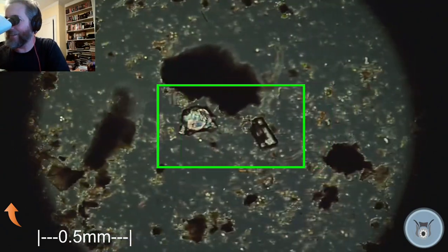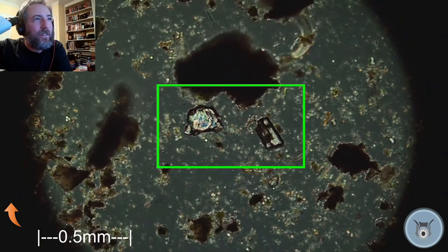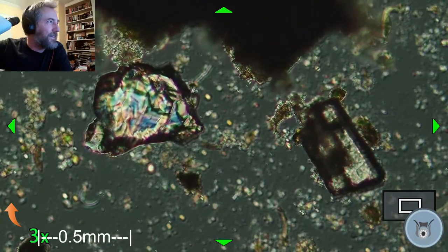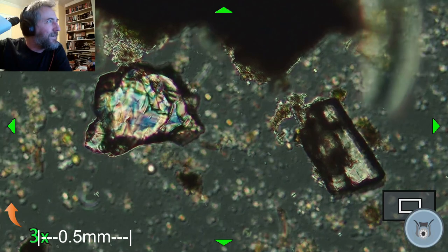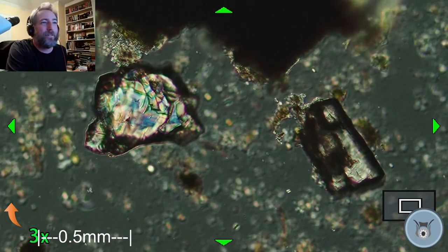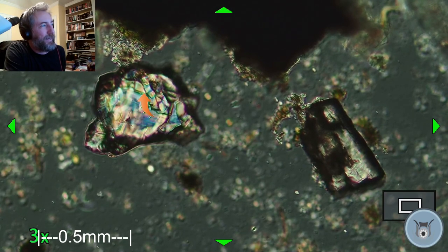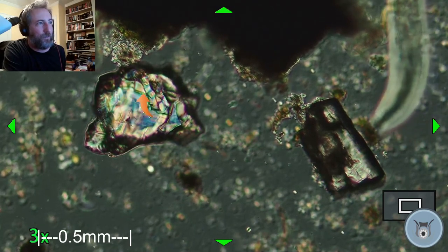I think that was Jan Cheer was asking about the birefringent materials. So you can see there's some right there. I pass over some of the, it's just a little piece of silica, I think. It's a little tiny silt grain. That you can see, it's got, sorry, a little geology for you while I'm here. In regular light, this would be clear. And then the polarizer is actually highlighting the face of this clast, which is a silt-sized particle.